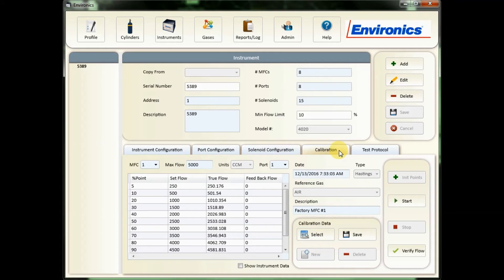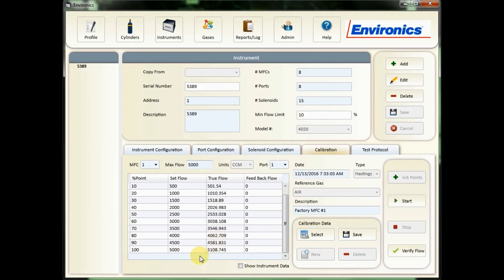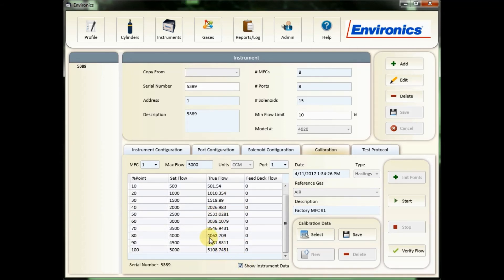Here you can see the calibration data for my MFC1, which is a 5-liter flow controller. If I want to verify that my newest calibration data is actually in the instrument, I would look at these values and then you can click on your show instrument data button. That will load what's actually in the system. You can see that that is the same. That verifies.